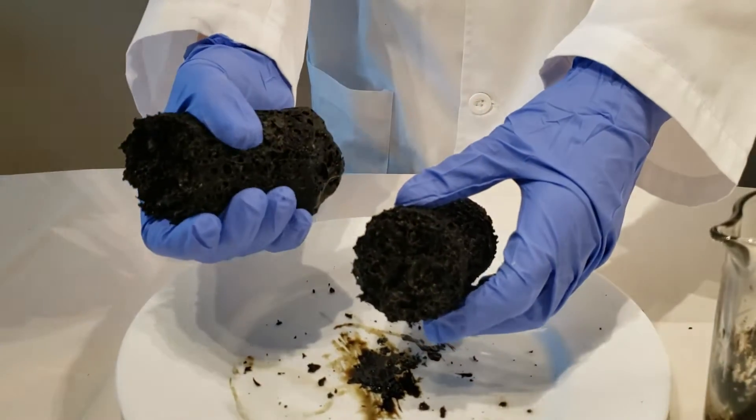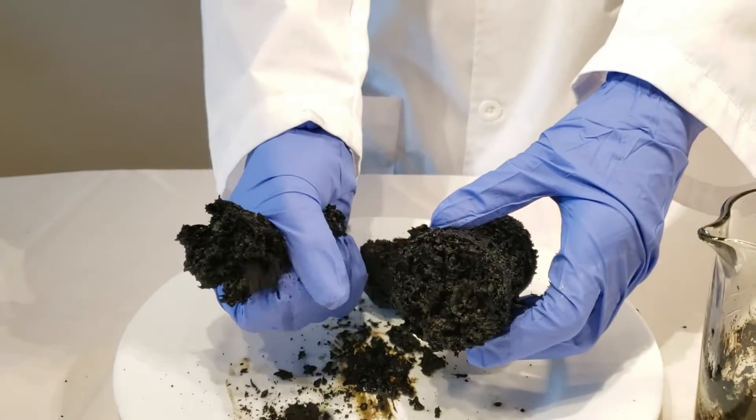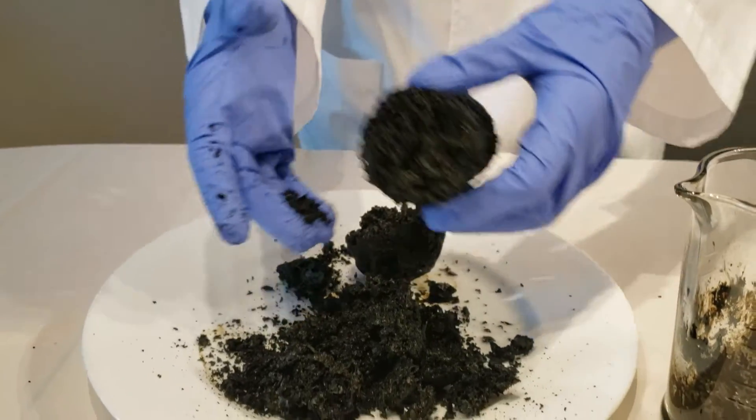I would just like you to know that this time the carbon snake, or whatever you call it, was a lot more crumbly.